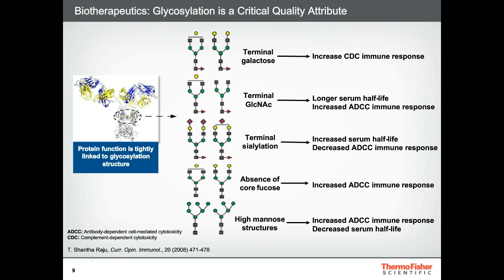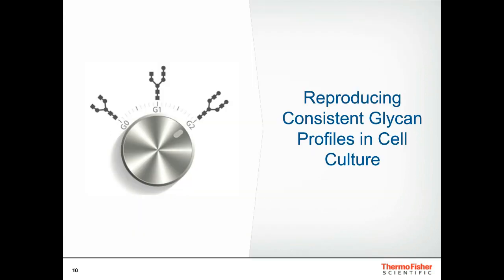Let's take a look at the ability to target selectable and controllable glycan profiles in cell culture.